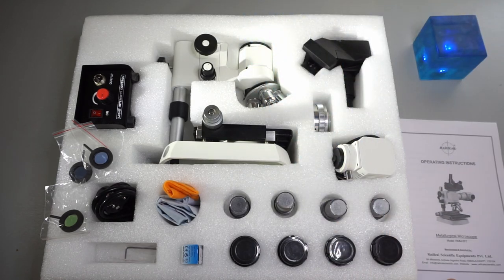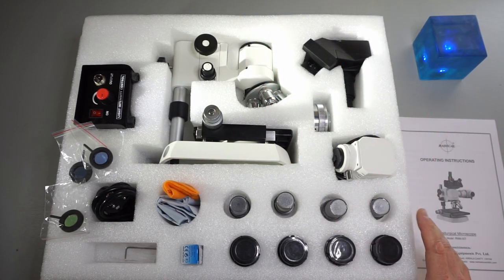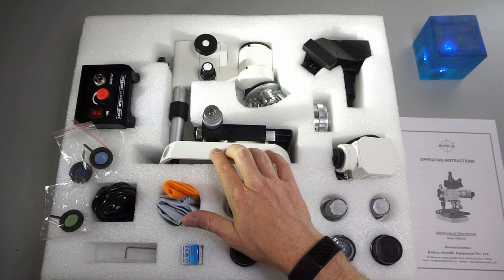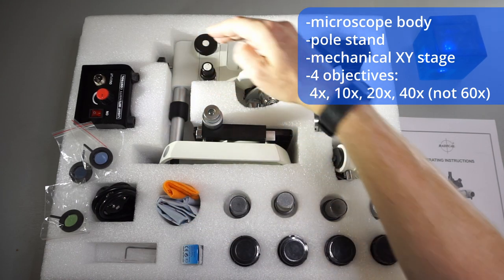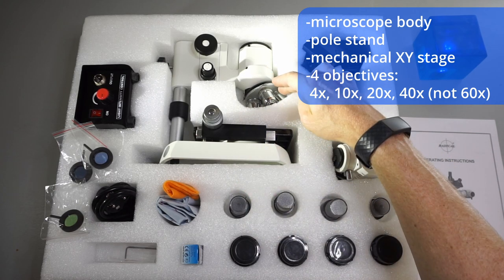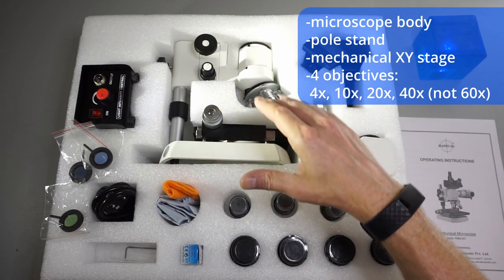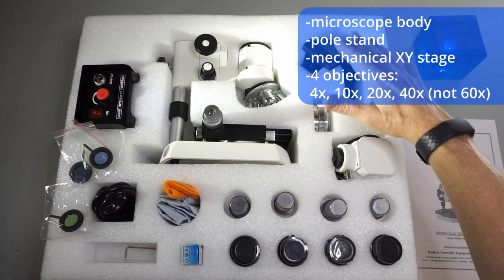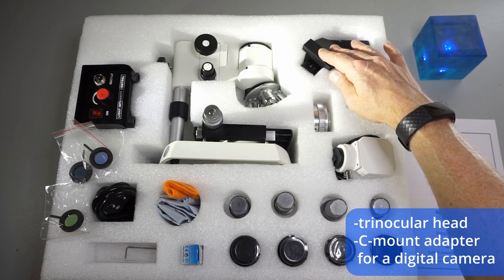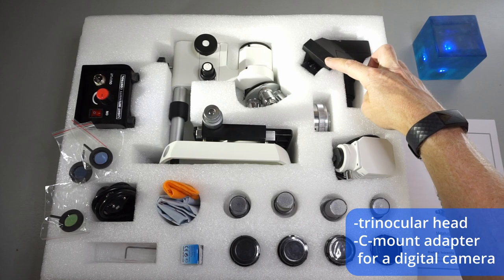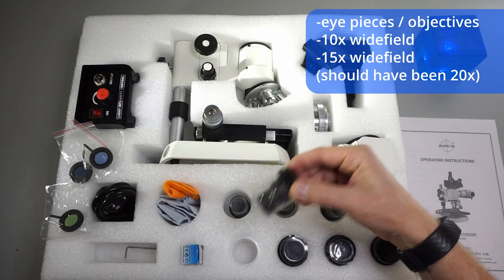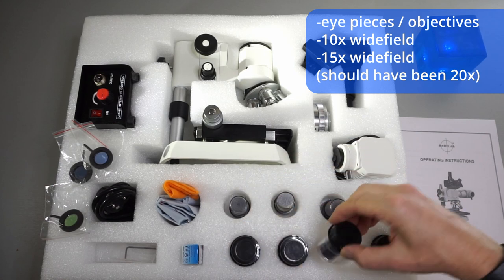I took away the plastic bag so I think it's easier to now look at the content of the packing. This is the microscope body with a pole stand, the mechanical XY stage. It also includes the four objectives: 4 times, 10 times, 40 times and 60 times. Here we have the trinocular head with a C-mount adapter for a digital camera, then we have the eyepieces 10 times and 20 times.